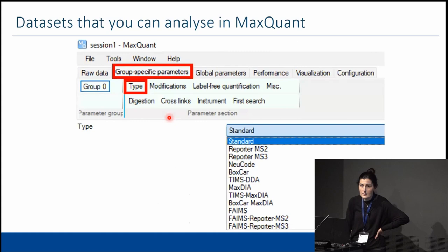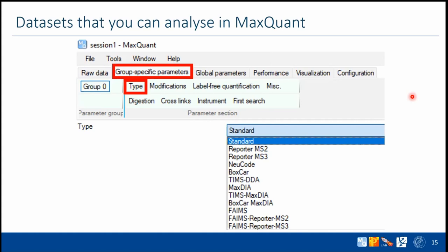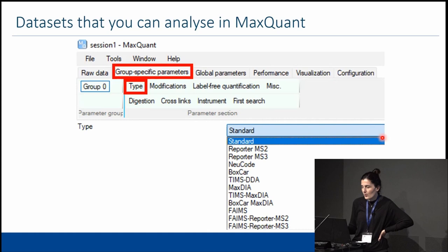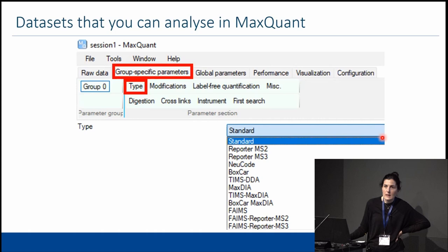In MaxQuant, under Group Specific Parameters and the Type dropdown menu, you can see all the different dataset types you can run: DDA and DIA datasets, MS2-level labeling, MS1 label-free, BoxCar, ion mobility datasets, FAIMS, and Astral datasets. Very soon there will be a new version out that can analyze Astral datasets if you're fortunate enough to have any.